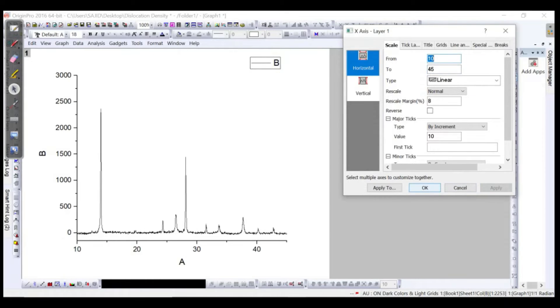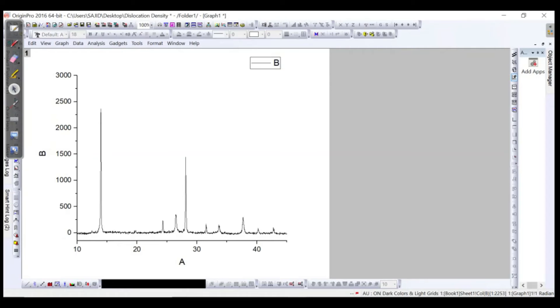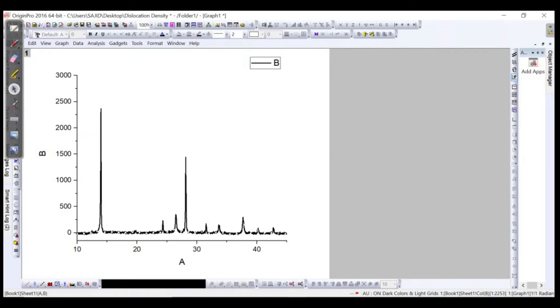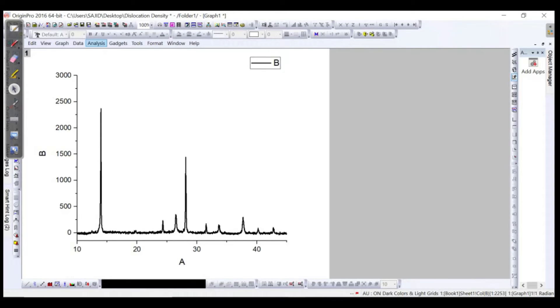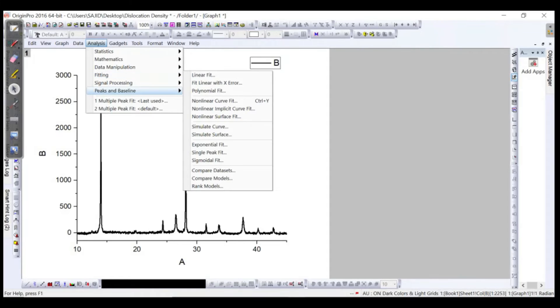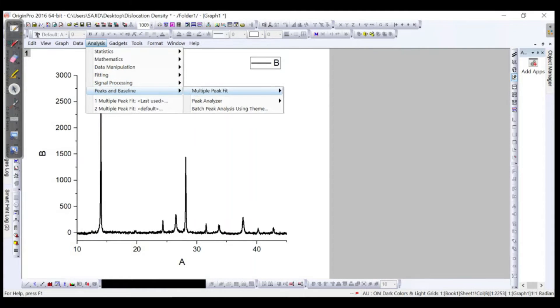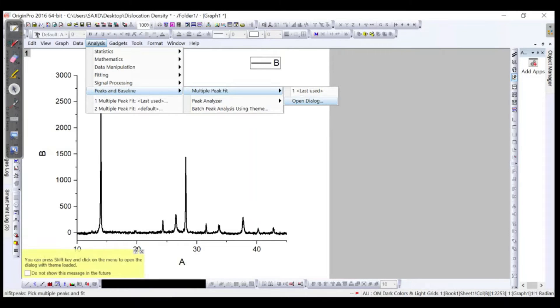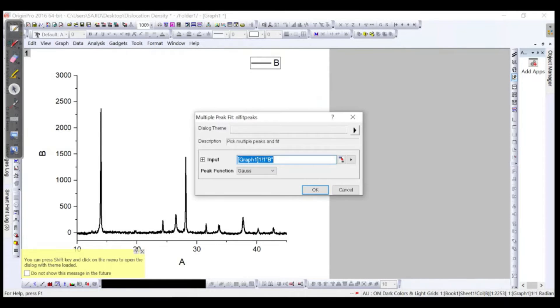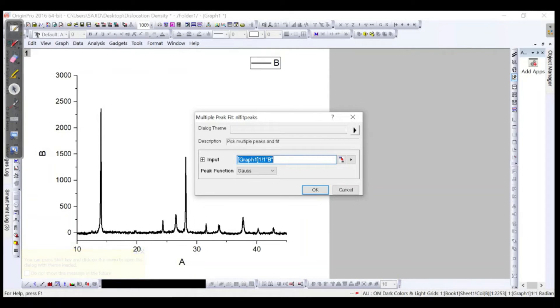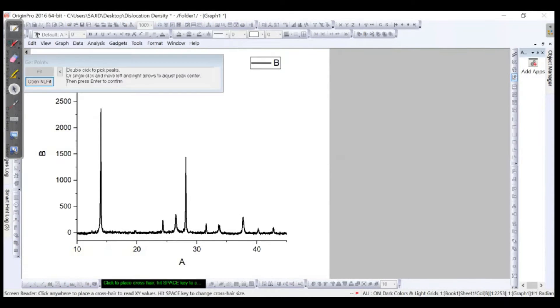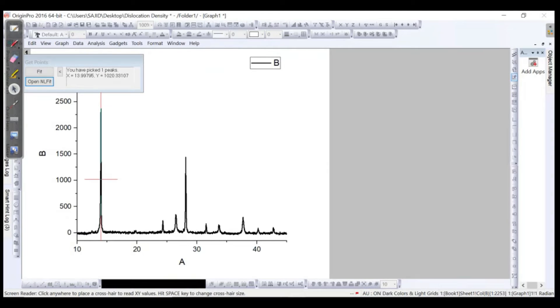Now as usual we will go for the analysis and then we will go for the peaks and baseline. Then we need to have the peaks or the multiple peaks over here. Here we should take care, as I mentioned before, the function should be Gaussian function and then we have to pick up all the peaks by double clicking on it.